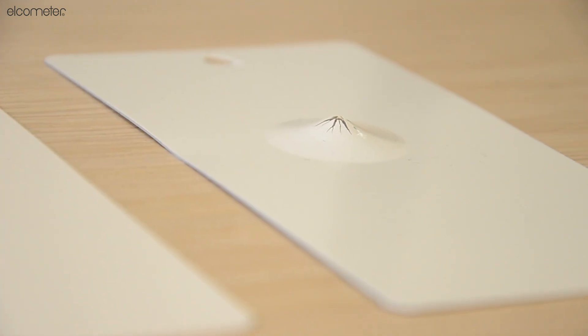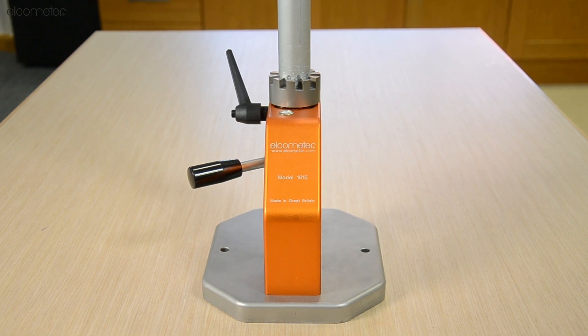This makes the Elcometer 1615 safe and easy to use.